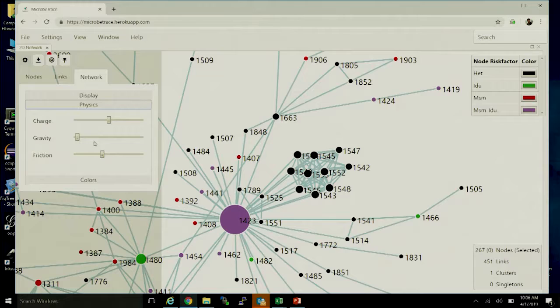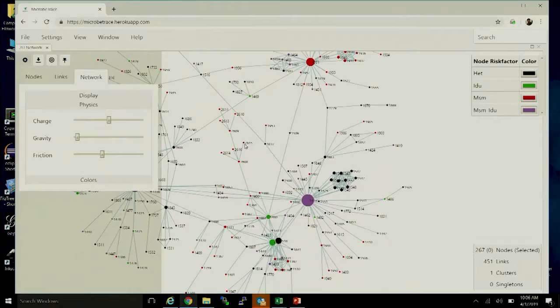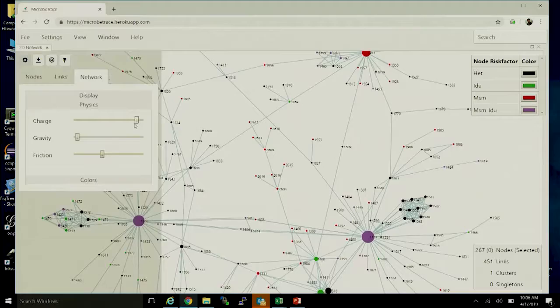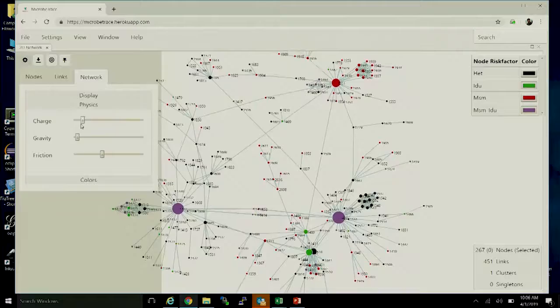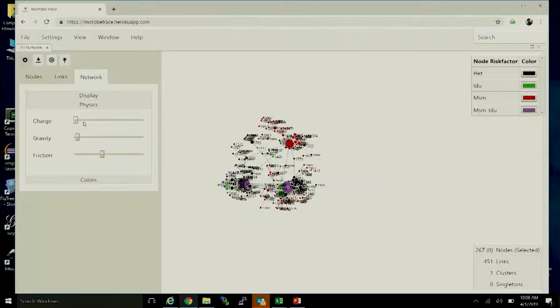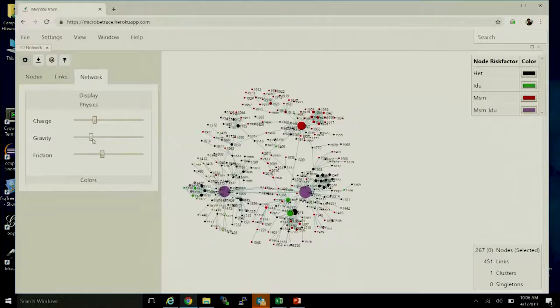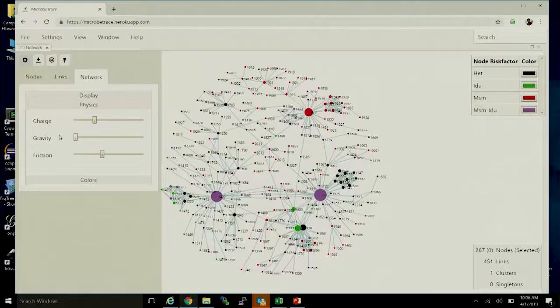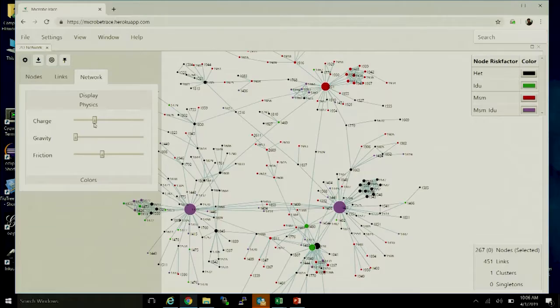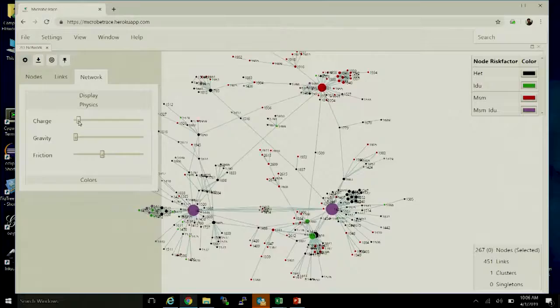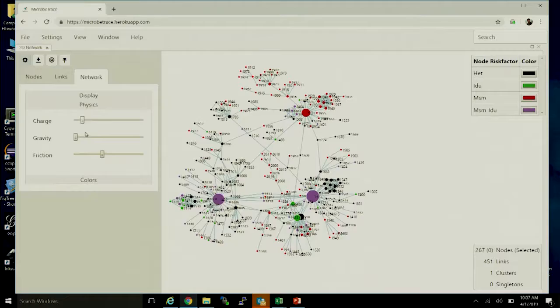The physics tab lets you customize the physics simulation where nodes push against each other. The charge slider indicates how hard each node repels others — low charge causes them to collapse together, high charge pushes them far apart. There's also a gravity feature that keeps everything centered on screen. Depending on what you'd like to achieve, you can play with these slider bars to get there.